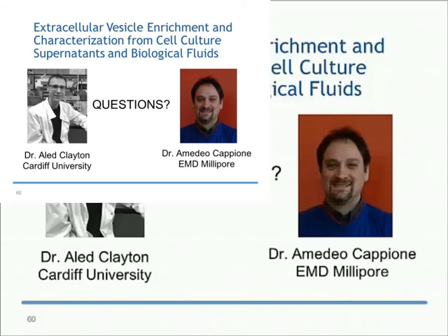The trick we found was to add some denaturing agents such as DTT to the system, and then we get proper, fully-fledged solubilization of the vesicles. So depending on what you want to do in terms of extracting the content, I think you'll need a fairly robust protocol to ensure that you're fully solubilizing the entire proteome within the complex of the vesicle. That's the best advice I have for you there, really.